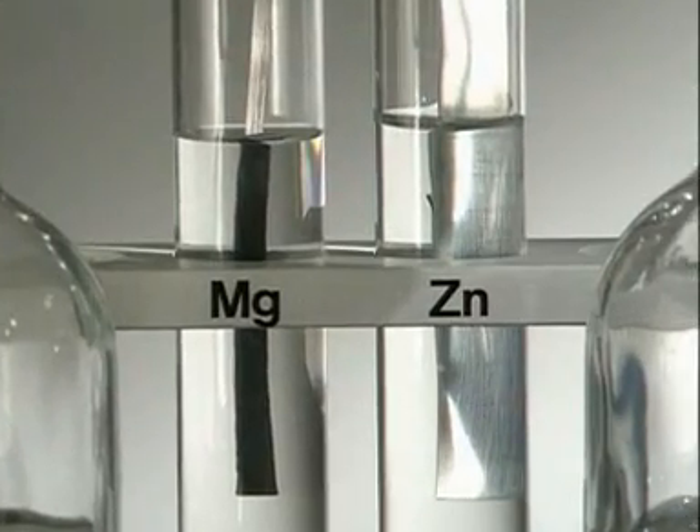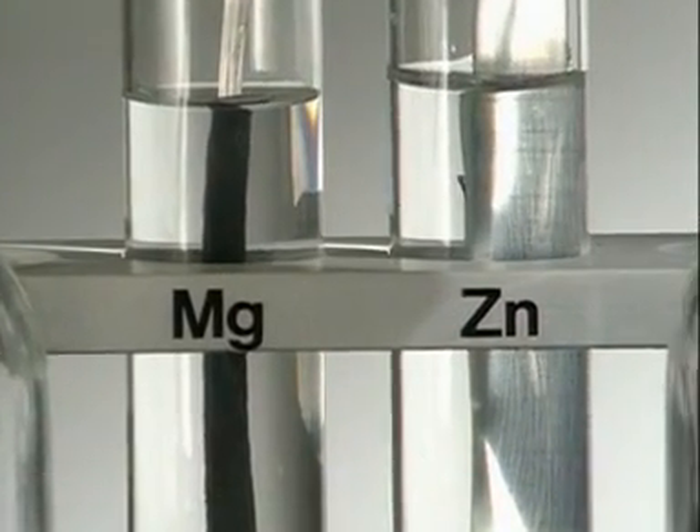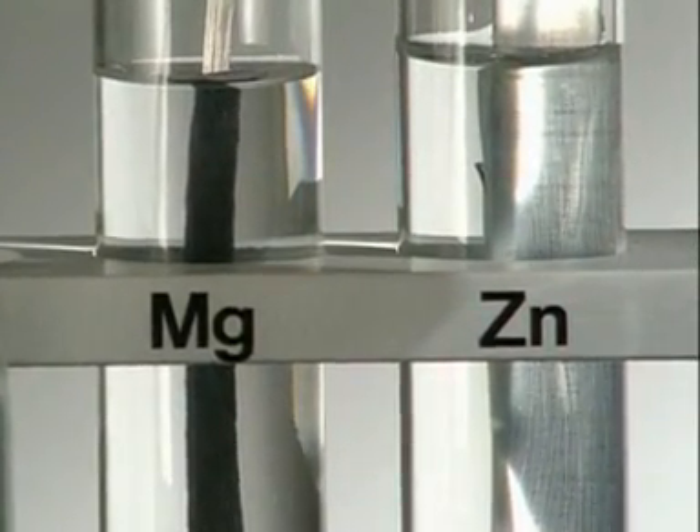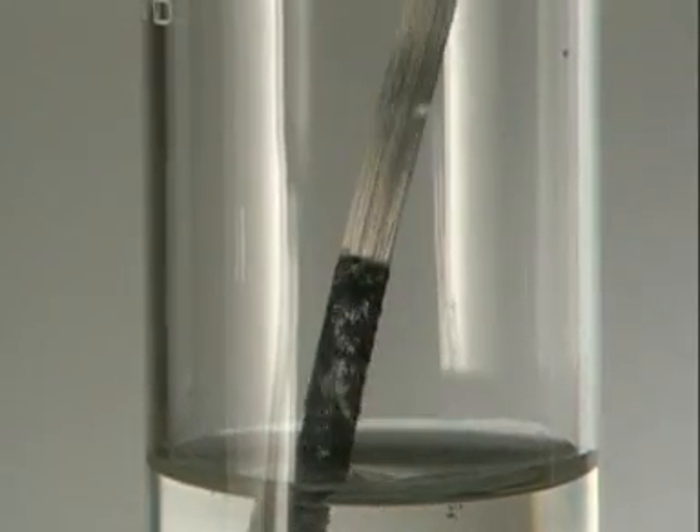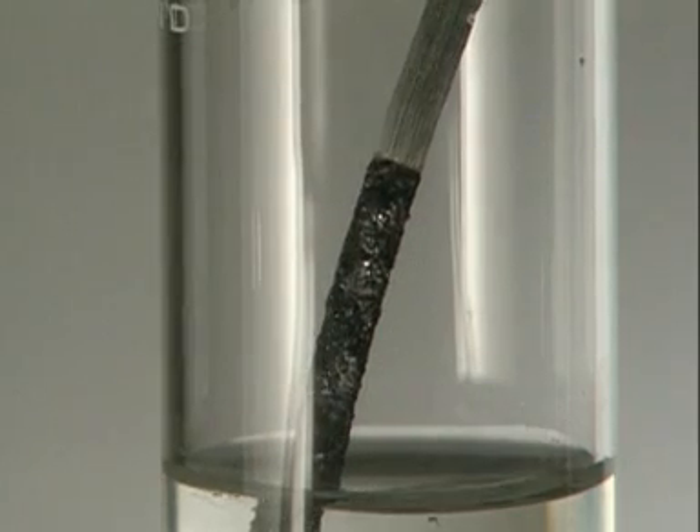Nothing happens to the zinc strip on the right, but magnesium reacts instantly, displacing the zinc from solution. Magnesium is the winner — it's the most reactive.